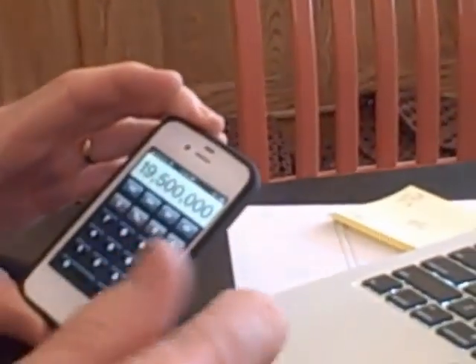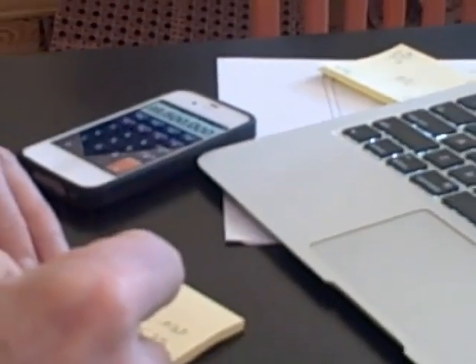Then we're going to take what we counted and add them up to 390 cells. The slurry density is 390 cells counted in five squares. We're going to multiply that, the 390 times 50,000, and that accounts for the squares we didn't count, which is going to give us 19,500,000 cells per milliliter.